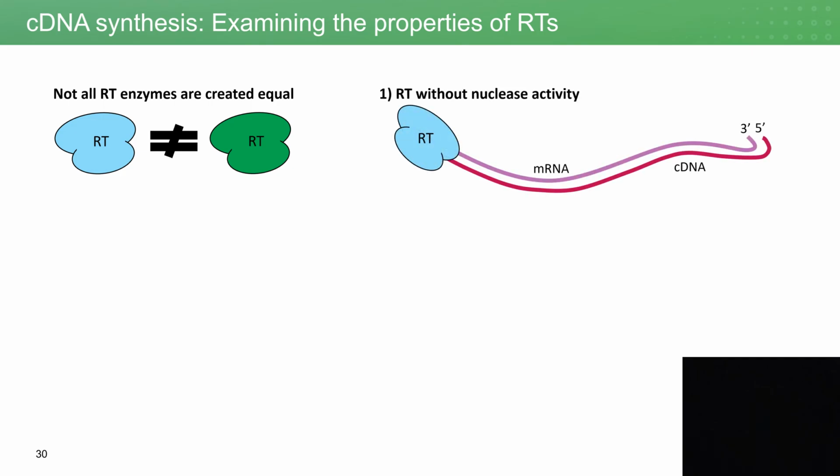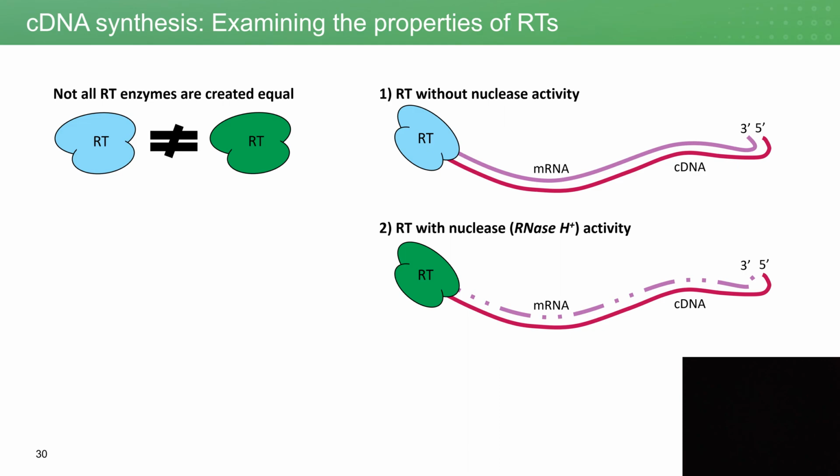Now that we've reviewed the two reaction setups that a scientist can perform in the RT-qPCR protocol, let's take a closer look at the reverse transcription reaction itself to examine the enzyme reverse transcriptase. You may have received the impression that all reverse transcription reactions occur with the same enzyme, but this simply is not the case. The truth is there are several different cDNA synthesis kits equipped with several different reverse transcriptases, or RTs. Perhaps the most general and important characteristic that segregates these RTs is whether or not they have nuclease activity, also known as RNase H+ activity.